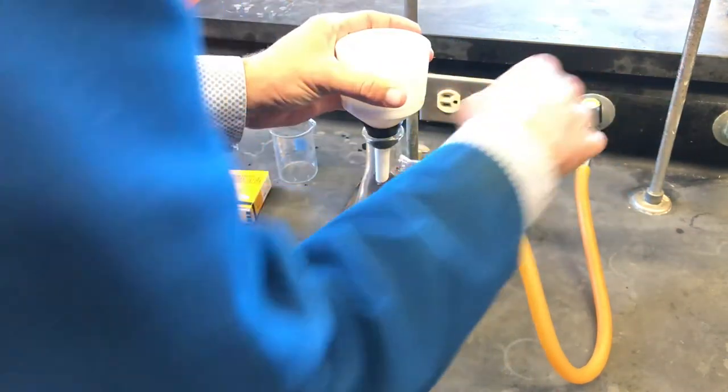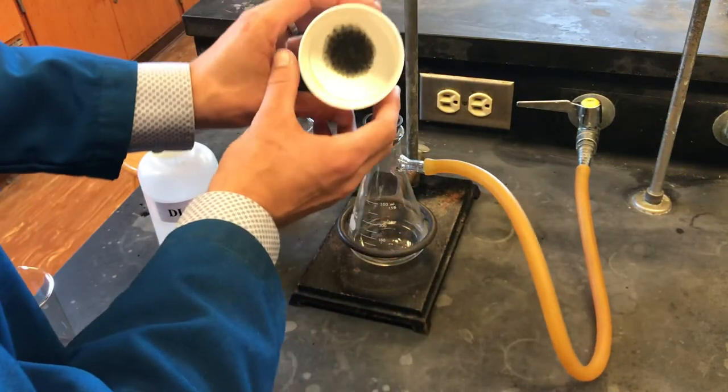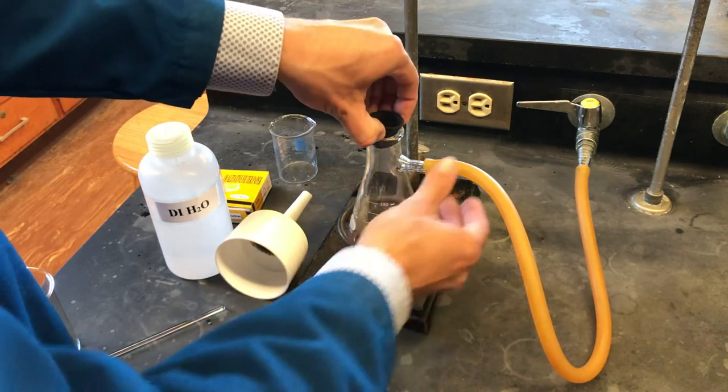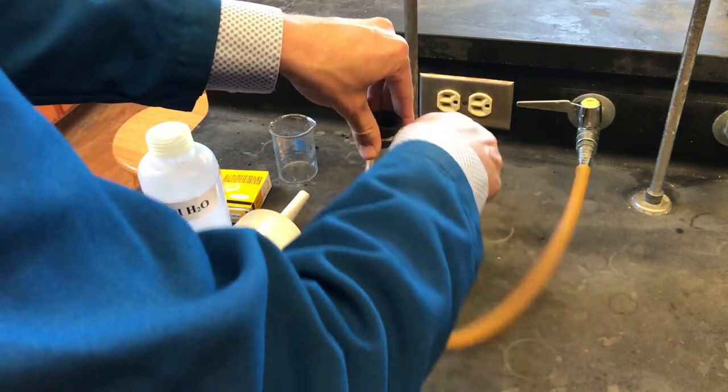As a result, our impurities are collected in the center of the filter paper and our filtrate, which is the solution in the flask, can carry on to the next synthetic step.